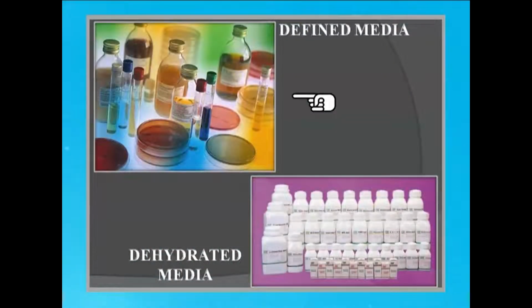There are various kinds of media. Especially in the laboratory, we can use defined media and dehydrated media. Defined media has all the ingredients specifically mentioned and we know the exact composition. It is expensive. Dehydrated media used in the lab is equally in the same fashion, but all the ingredients to make up the medium are combined together and mixed as powder, used just by addition of water. But in the lab, we are using these media which can be really very expensive.